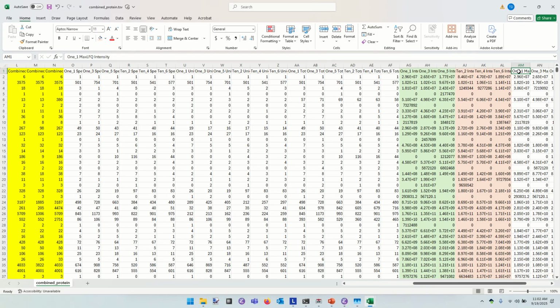Is this noise value sample related? Or is it like a standard, like below a certain number it's considered noise, or it really depends on the actual sample you provide? It depends rather heavily on the sample. If you're doing something like biofluids, the dynamic range of those samples is such a mess that trying to look past the first couple hundred proteins is just really devilishly difficult. In this case, we're dealing with cell lysates, and that's a pretty favorable environment for looking through a lot of orders of magnitude. But a given sample may complicate or ease the quantitation of proteins in it.